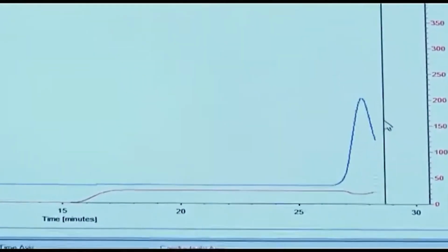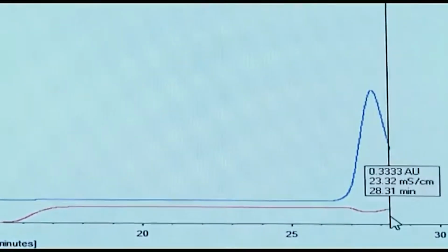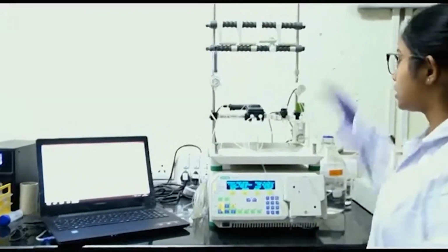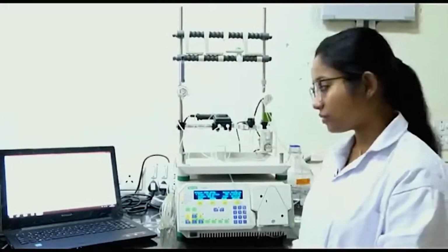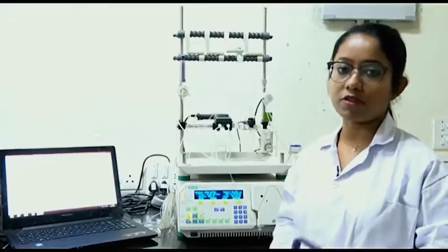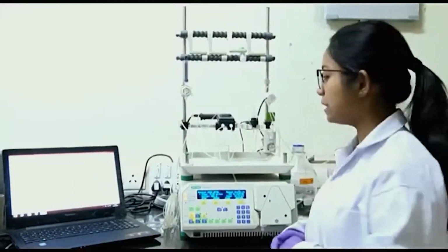Anything which does not have histidine is coming out. We have to wait till it goes to a straight line again. That means my protein is inside the column and the other proteins have come out completely. After that happens, we will start the elution. We need to take our protein out of this column; it should not be stuck to the column for eternity.